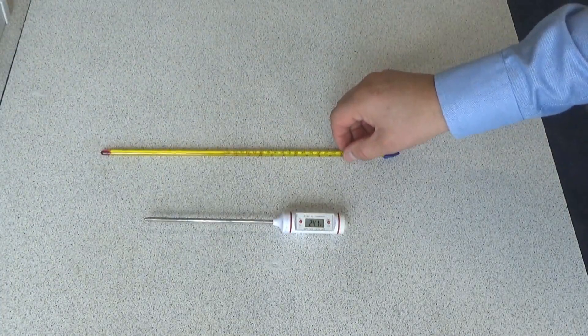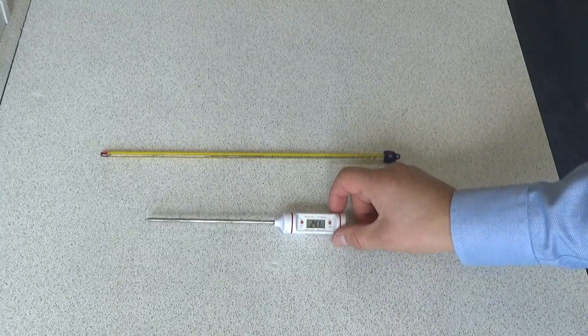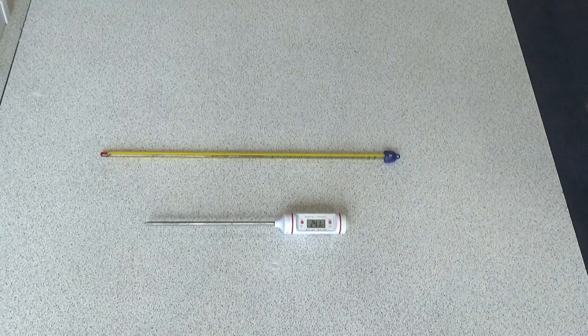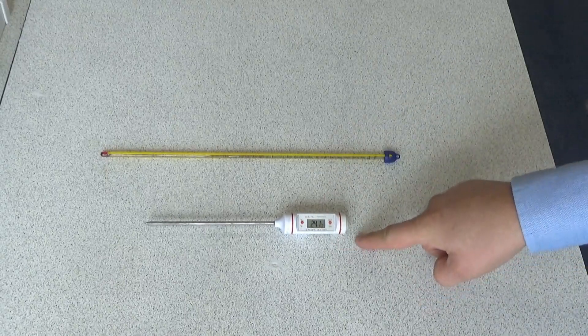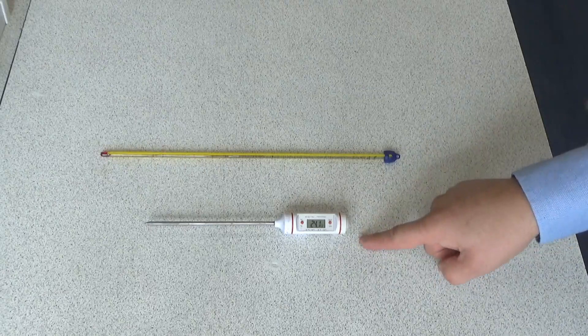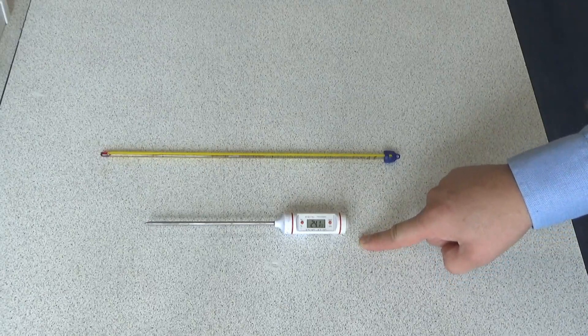A standard thermometer will measure to the nearest 1°C, whereas a digital thermometer will measure to 0.1°C — for example, it's currently recording 24.1°C. We say the digital thermometer has a higher resolution. That's a phrase you need to remember for your exam.